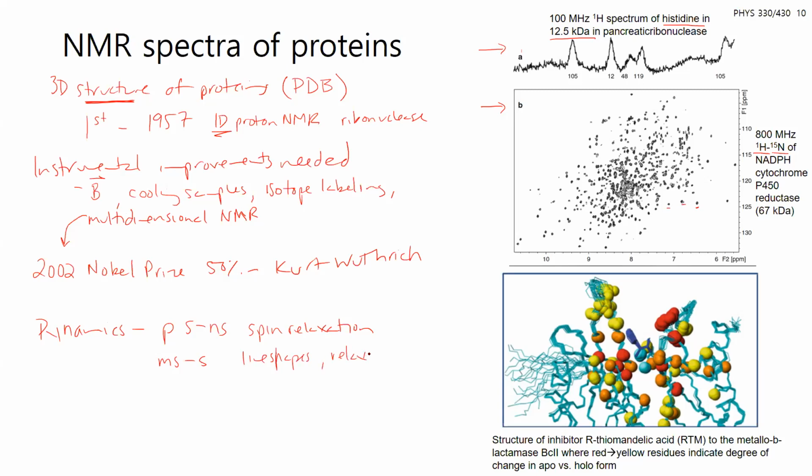Or relaxation dispersion. And you can even get to minutes to hours if you introduce hydrogen and deuterium exchange. You can exchange those protons out if you flow a solution in to see reactions that exchange or ligand binding. It's very impressive, the orders of magnitude of time scales that you can probe with NMR looking at these proteins.